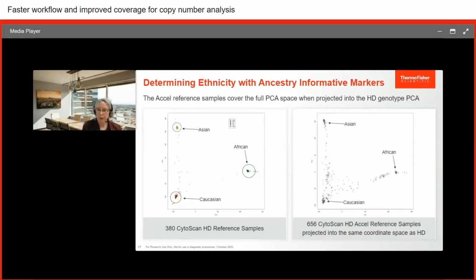Principal component analysis is a statistical multivariate analysis that reduces large complex data sets into 2 dimensions and enables visualization of the data so that we can see correlations between the data and identify any potential sources of variability.